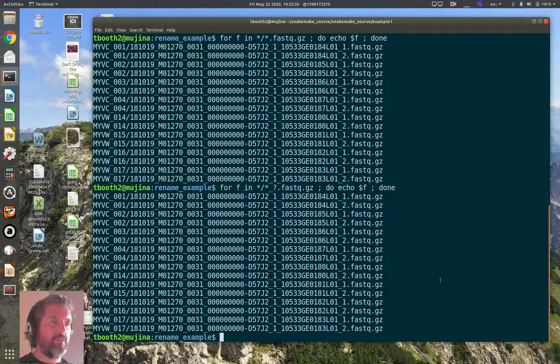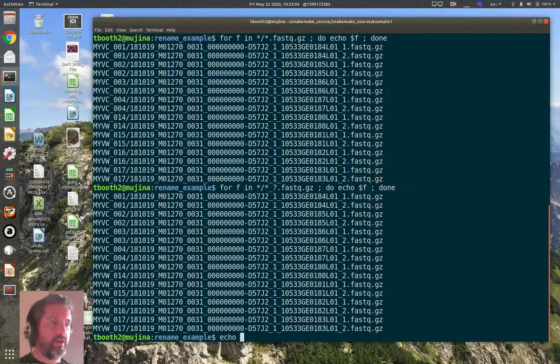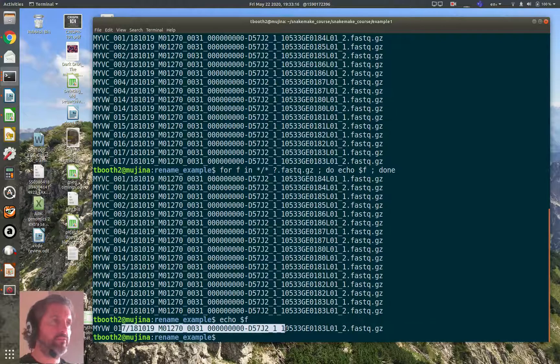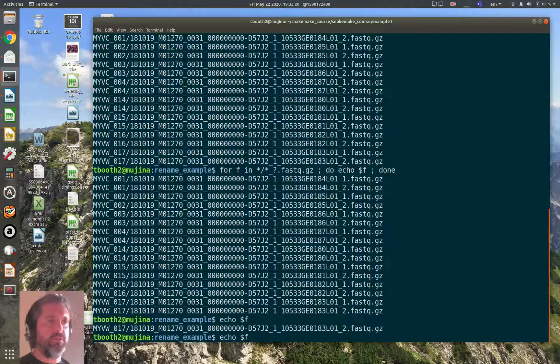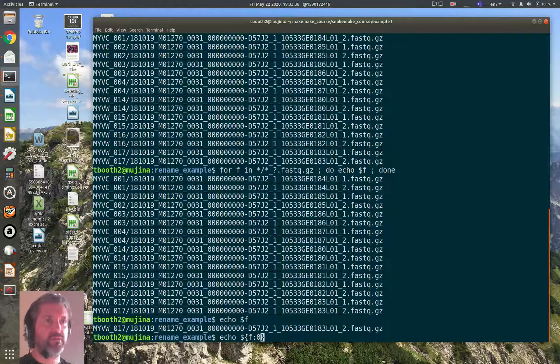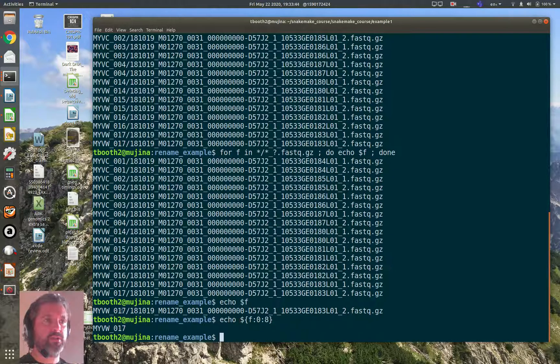The shell gives you various features for chopping up bits of strings, so let's have a play with those before putting them back into the loop. Because I ran the loop using variable `f`, it's still set to the last value — the shell doesn't clean it up. So I can `echo $f` to work with that last filename. To get the sample name, that's the first eight characters. I can use the syntax `${f:0:8}` — starting at the zeroth character up to the eighth — and this prints out the sample name.